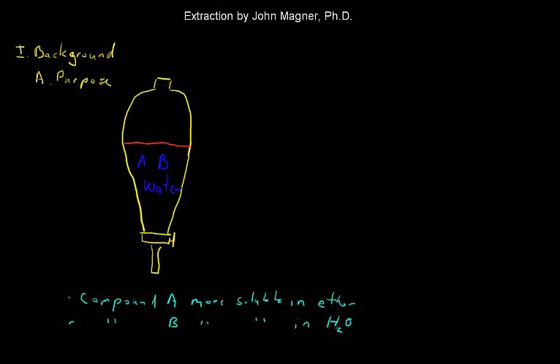Welcome to the 24-23 video on extraction. The purpose of extraction is to separate or purify compounds by extracting a substance from a solution into a solvent in which it is more soluble.